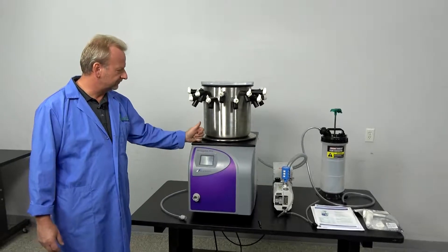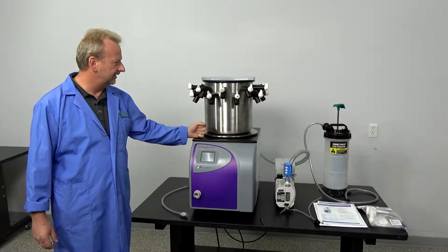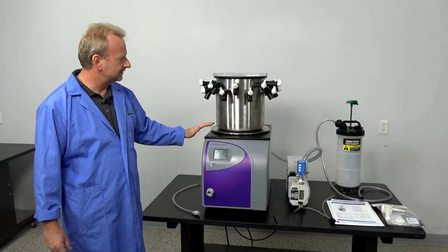I do a lot of Virtus freeze dryers, floor models especially, but this one came in and we didn't have to do anything to it other than just clean it up. I'm just going to go over a little bit on what's included with this.